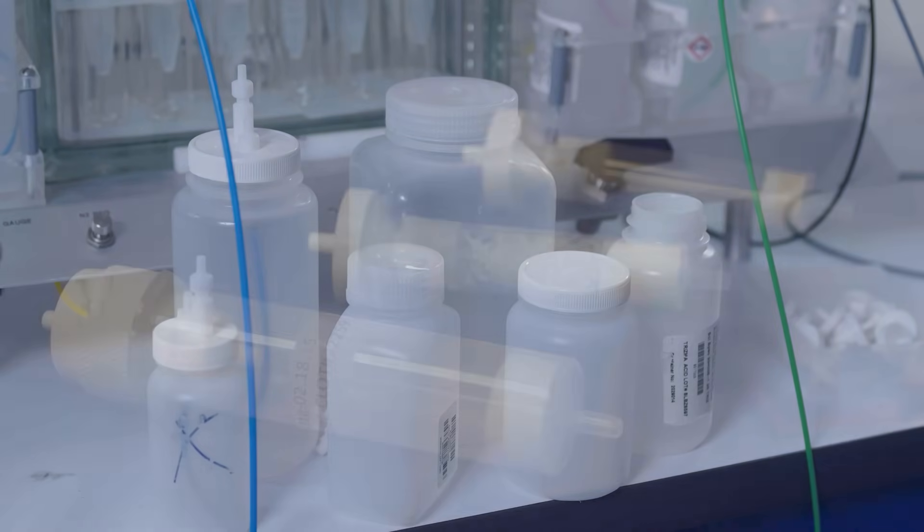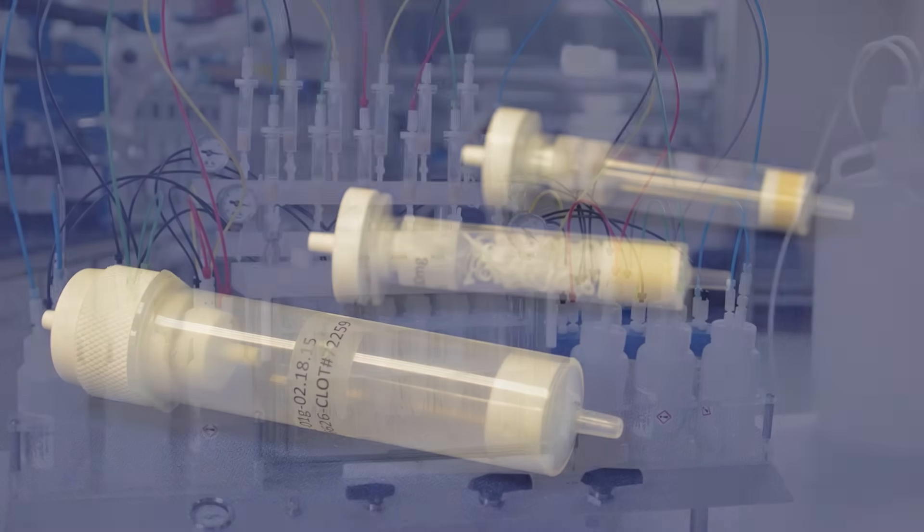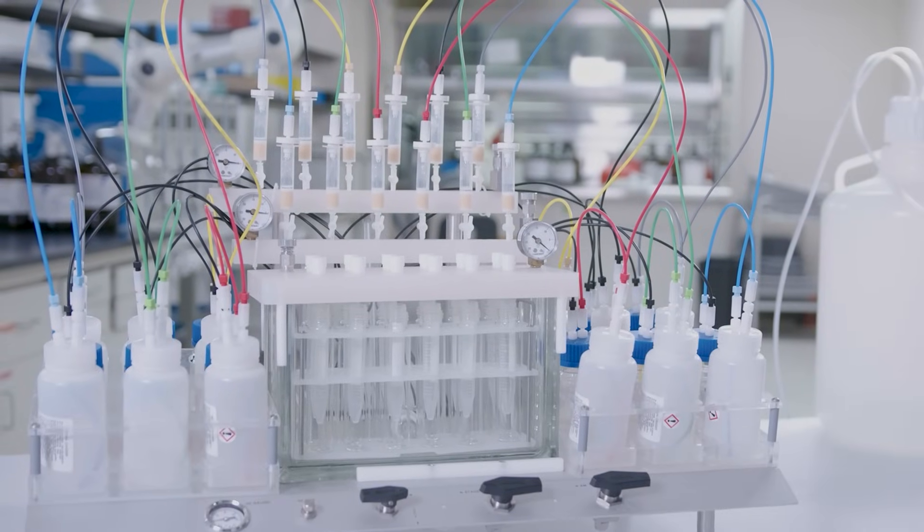Comply with existing methods that require vacuum, positive pressure, and precise delivery of sample and solvents. Drinking water.